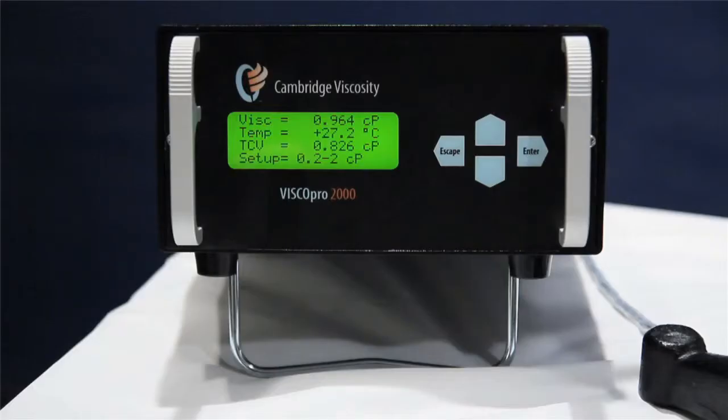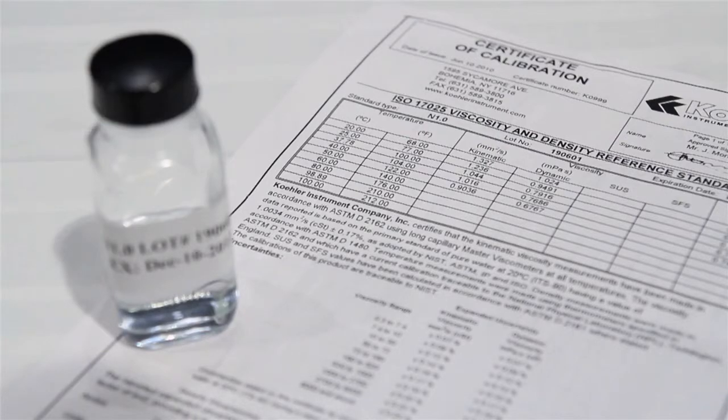After the sensors reach thermal stability, viscosity and temperature values can be compared to the viscosity tables provided.